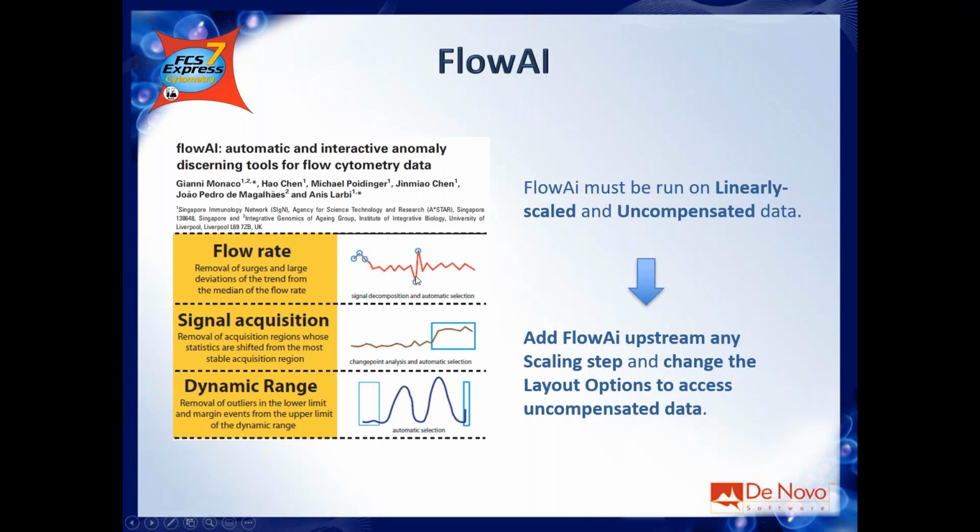Let's say that in a second you acquired 100 events, 100 events in the second after, and then for some reason at a given time during the acquisition we have 1000 instead of 100, and maybe the second after it's 0. If you see any of those fluctuations, probably something went wrong during the acquisition. So Flow AI, thanks to the flow rate, will remove those bad events.